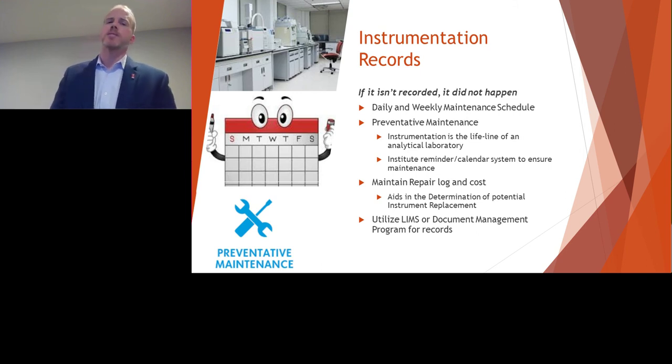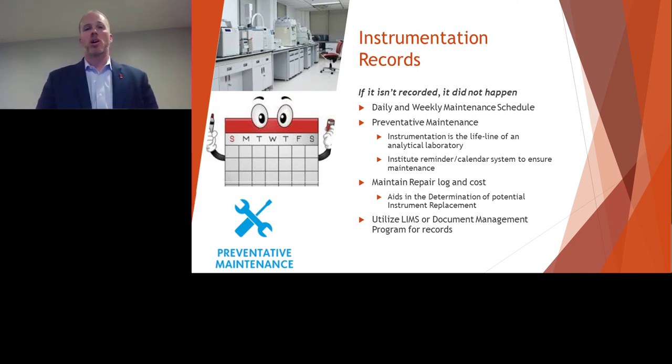And also another important process to look at, not just your maintenance logs, but also be looking at your repair costs and be able to maintain records of that, so that you can start looking at, this particular instrument or these particular processes starting to cost quite a bit of money in repairs. That way, is it time to look at upgrading an instrument or replacing an instrument, and you can actually have documentation to help make those determinations.